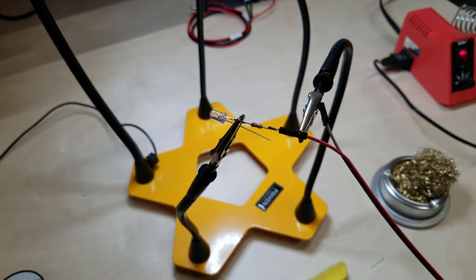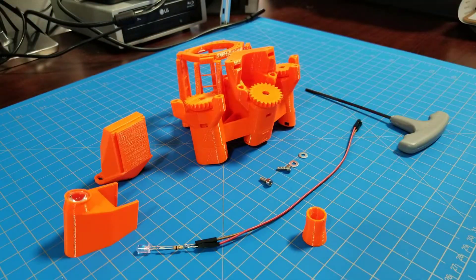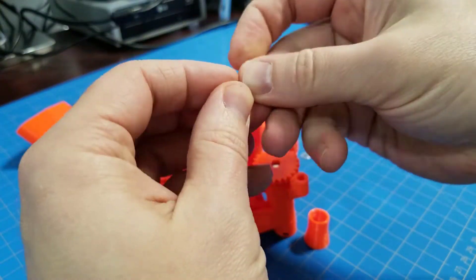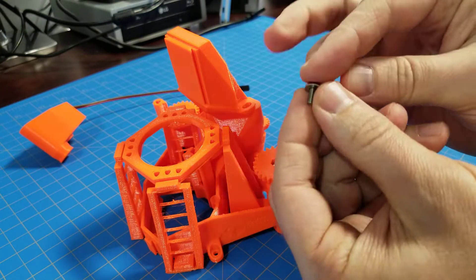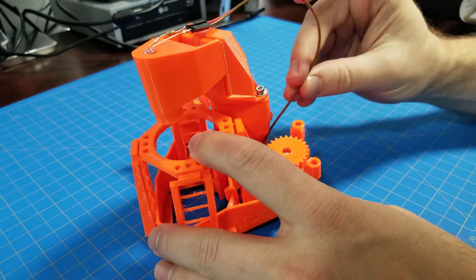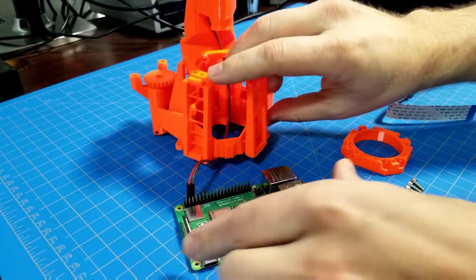Here I am soldering the LED to the resistor and wires, and then assembling the illumination module. Then I connect the LED to the resistor, connect the camera to the Pi, and assemble the sample clips.